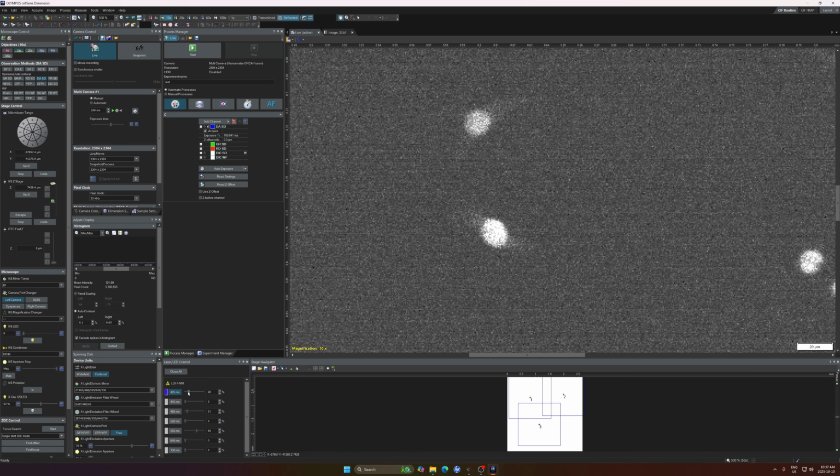I think if I stop live and activate it again, it didn't change that much. I thought it would. Yeah, that's basically, I think, the pinhole mismatch, and you don't see it. But the picture did improve. If I zoom out with the mouse wheel, you can see this histogram, and you can readjust this.